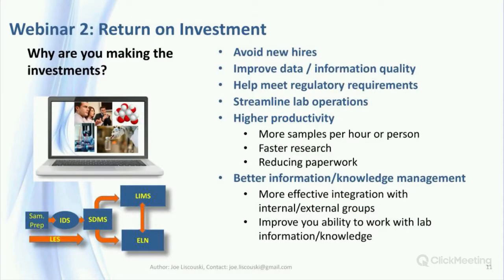When you're considering lab informatics and automation projects, someone's going to ask, what's the return on investment that you're asking for? How do you answer them? The introduction of informatics and automation technologies into laboratory work will require larger investments than typical lab bench spending and involves people from outside support groups. It also touches on knowledge and intellectual property management, an increasingly important corporate topic. Your ability to address these points within the return on investment conversation will have a direct impact on the approval of your projects. We'll begin by looking into these considerations.